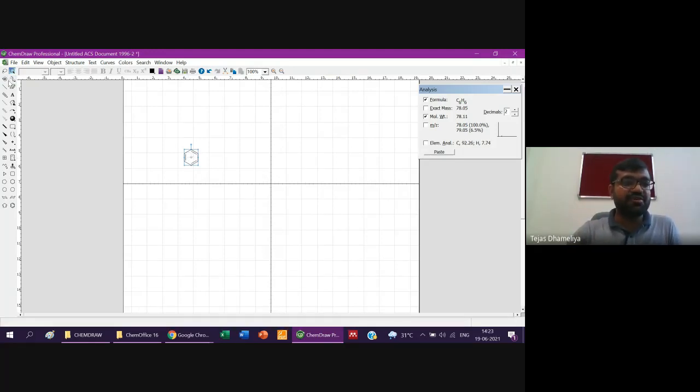These are additional tools, maybe not required right now, but if you want to see the change, then click on that, put it on a structure, press your left mouse button and move it, so you can see now you can rotate the structure. And that way you can modify accordingly.